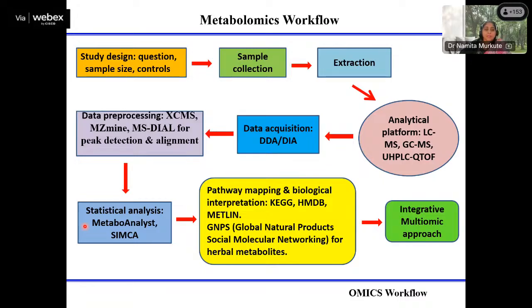Then statistical analysis is done, as I have told, by two particular software: MetaboAnalyst, which is a free software and is mostly used by many people, and Simca.